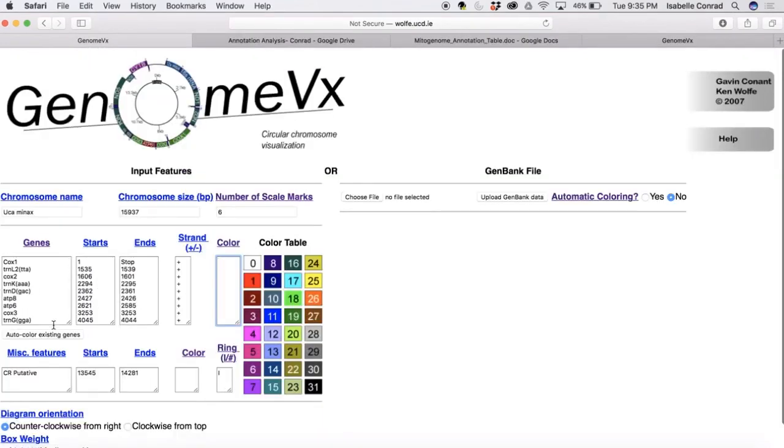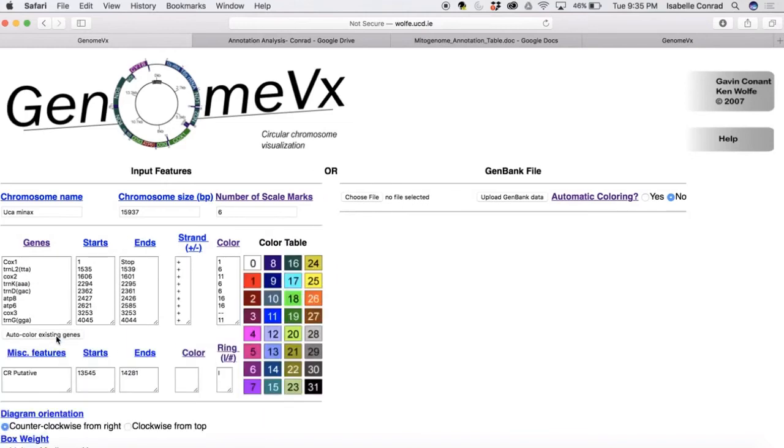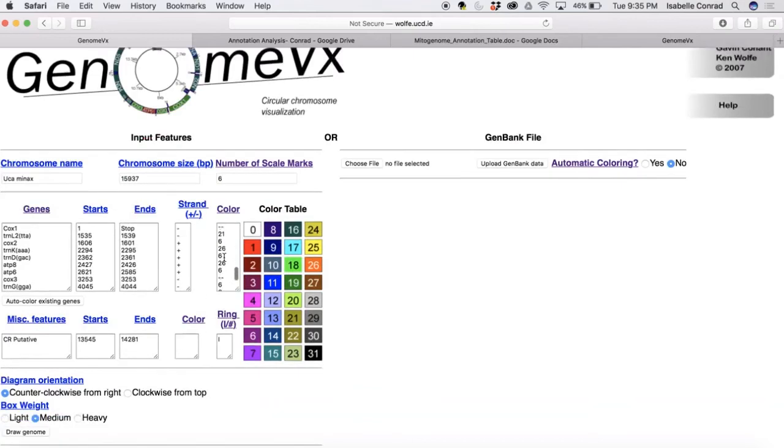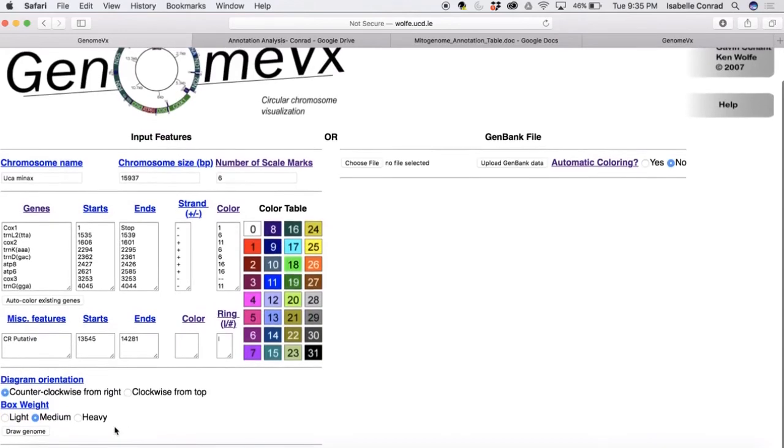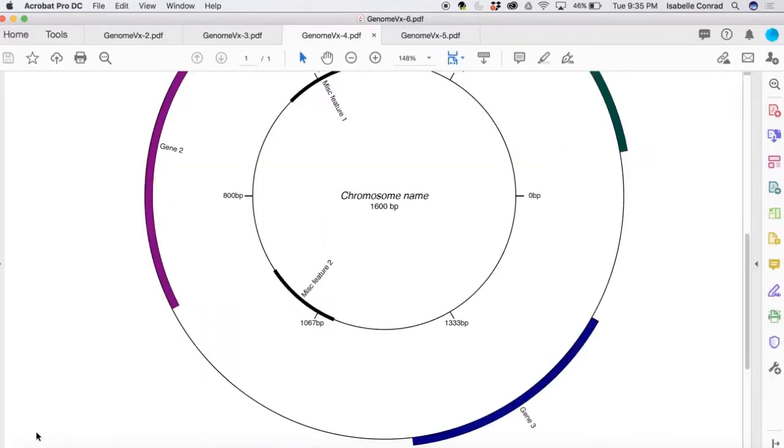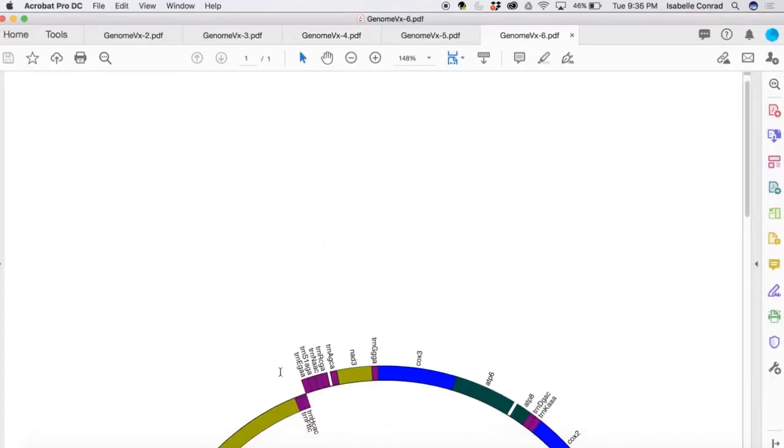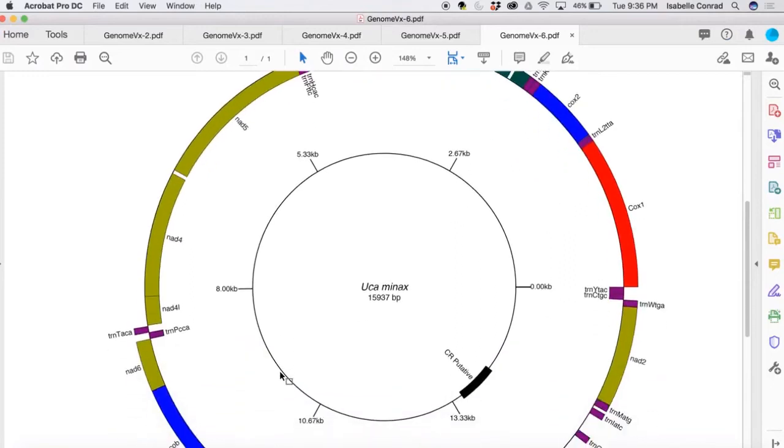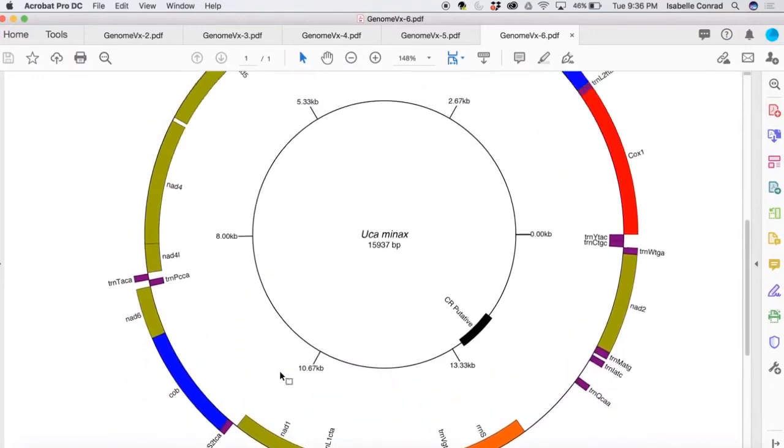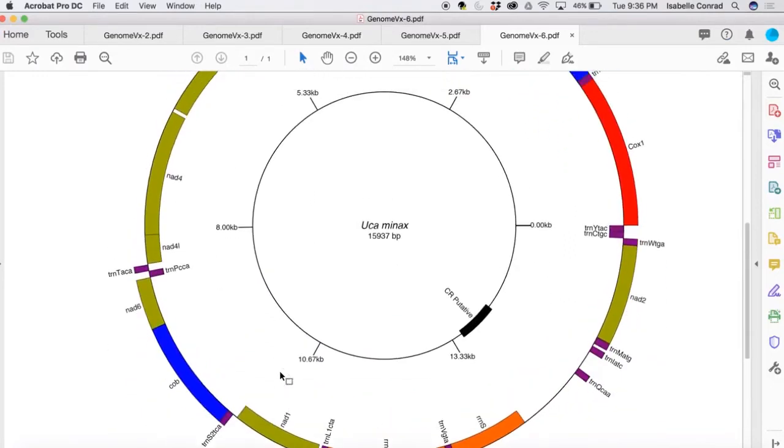So now we're actually going to go figure out the colors that I was mentioning before. You're going to click on the button that says auto color existing genes and that is going to assign colors to each gene. So I think we can go ahead and make our visual now. So we're going to draw the genome and it downloads onto your computer as a PDF file. So there it is.